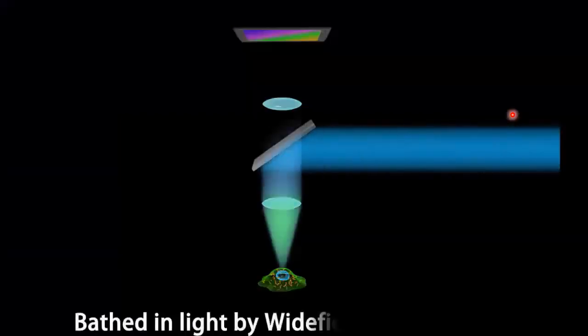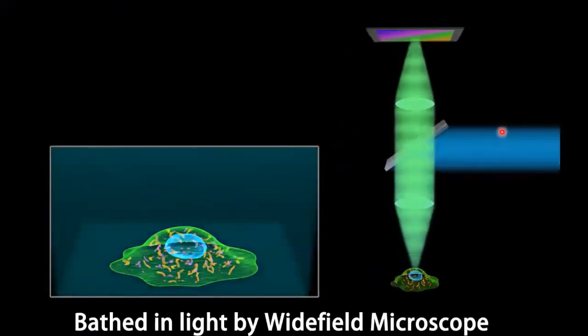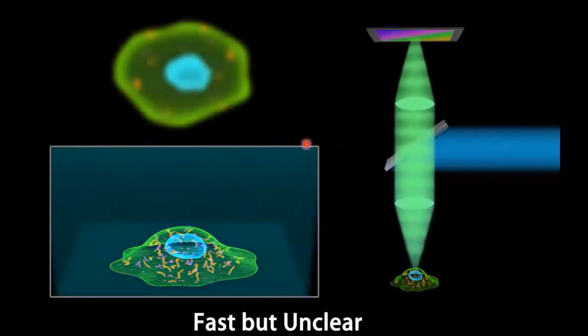So I found this video from the company Yokogawa that explains what a wide field microscope is. So you have the light, it shines on the sample, and the sample is going to emit light, and you can detect it.